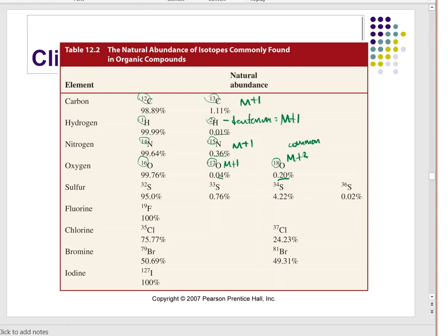We saw them in infrared. My carbon double bond O, my carbon double bond OH, my carbon double bond with another double bond O, my carbon double bond O in between a molecule, esters, anhydrides, amides, ketones, aldehydes, all of them, alcohols, carboxylic acids, they all had oxygen.